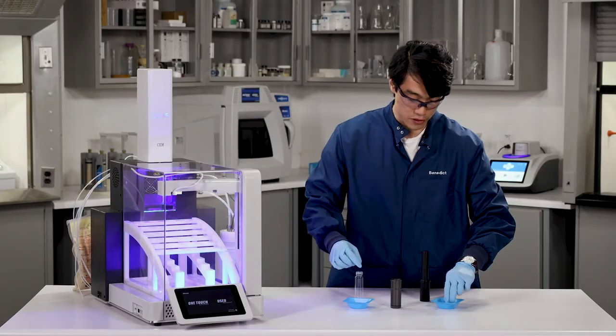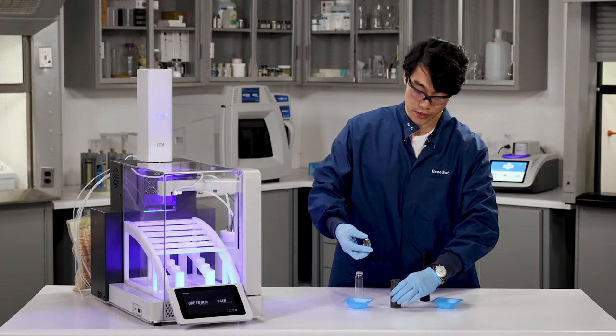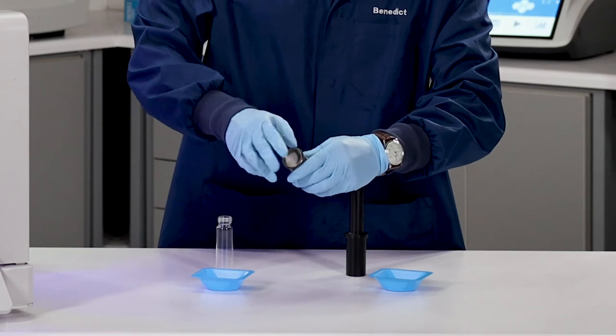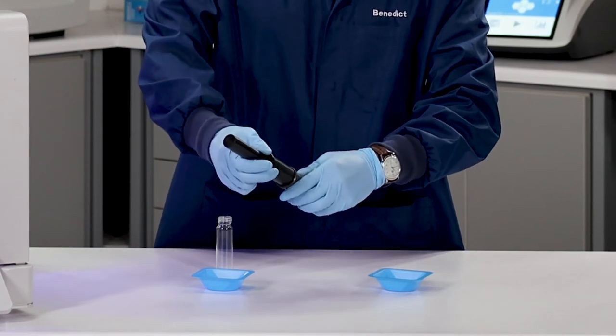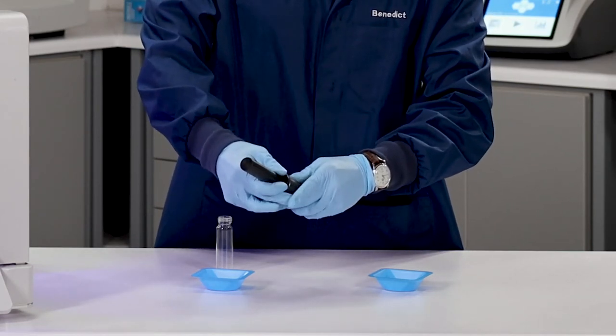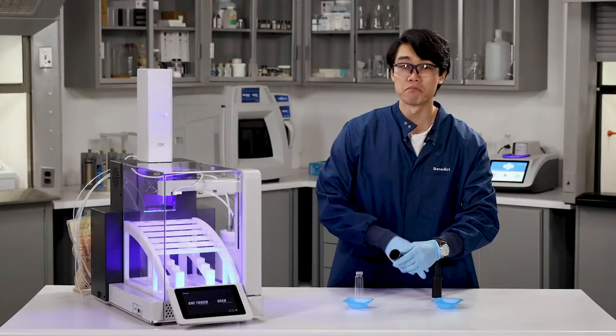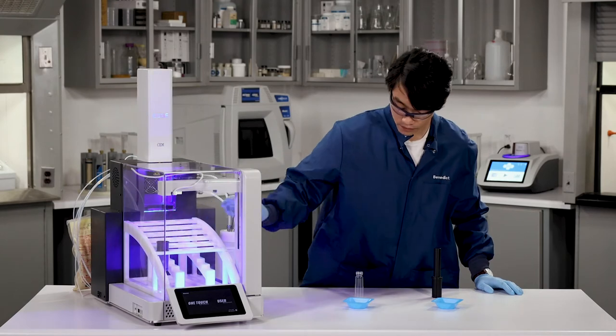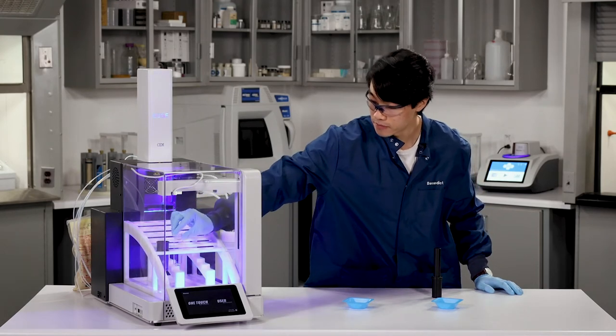And the last thing that I'm going to do is I'm going to take one of our Q-screens in order to keep the sample submerged in the solvents, place it on top, and push it through the opening. And just like that, we're done. I'll go ahead and place the Q-cup into the rack with a vial right beside it.